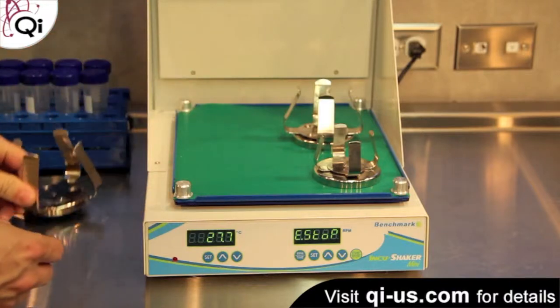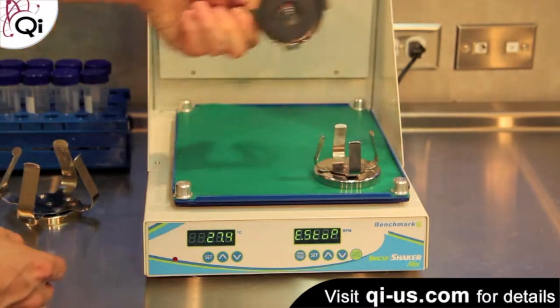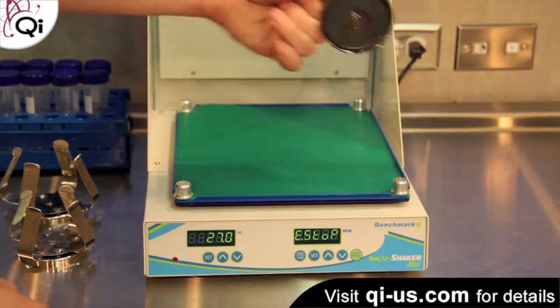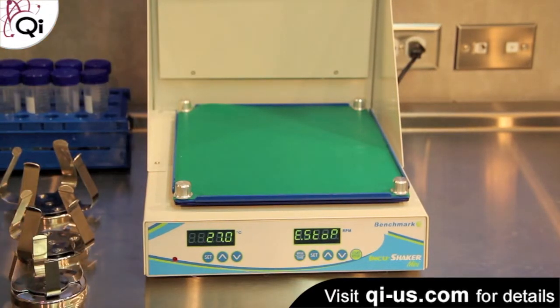This innovative clamp system replaces the typical clamp system which is bolted down to the platform with a magnetic platform and magnets attached to each one of the clamps.